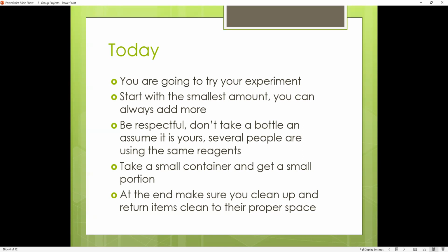so that way you kind of get in that ballpark. So if you have questions, just come see me, but just really start small, use the smallest amount, and then scale up versus starting with a huge volume, like a whole gallon of milk, and then trying to find the pH. It's just a waste, right? If you're going to stick a pH probe in there, you just need a big enough volume to cover the pH probe.